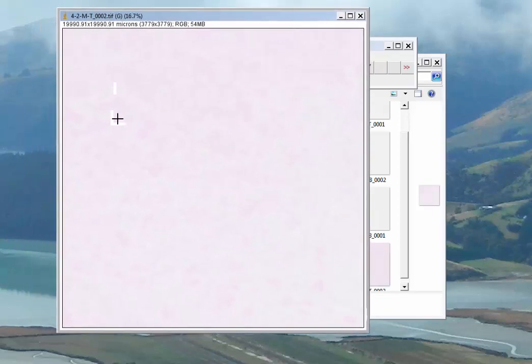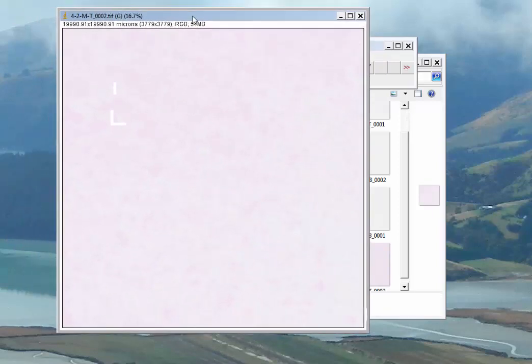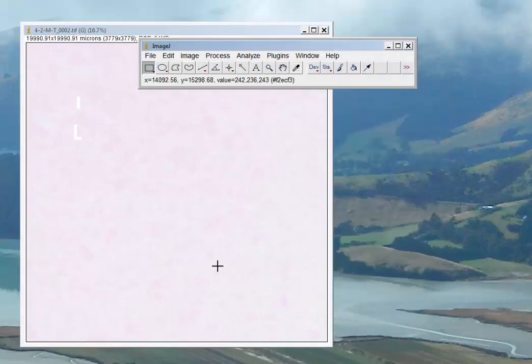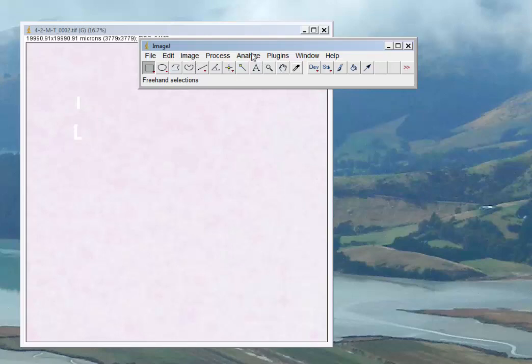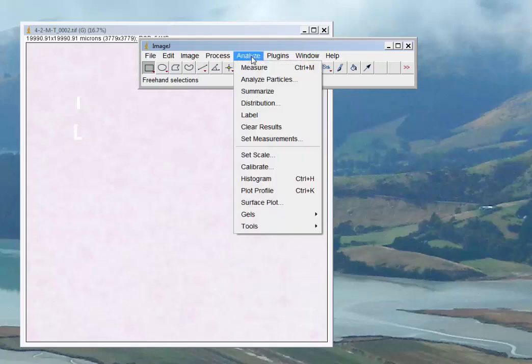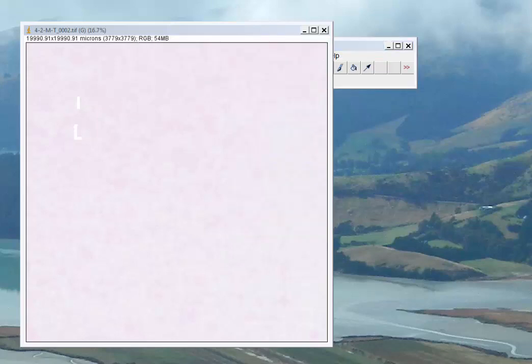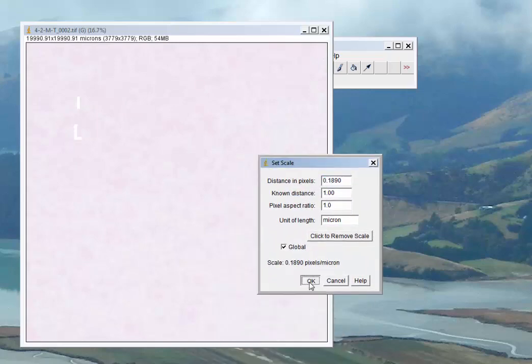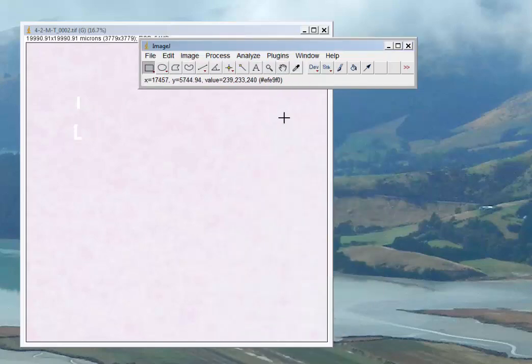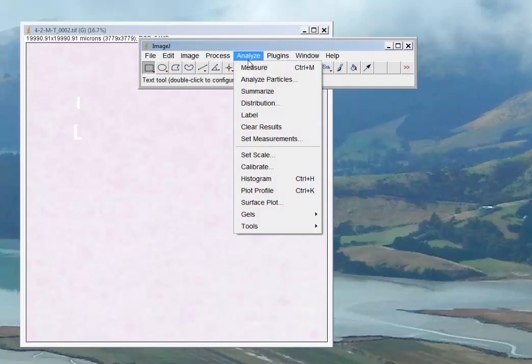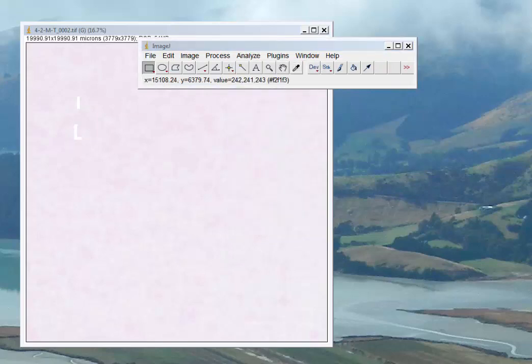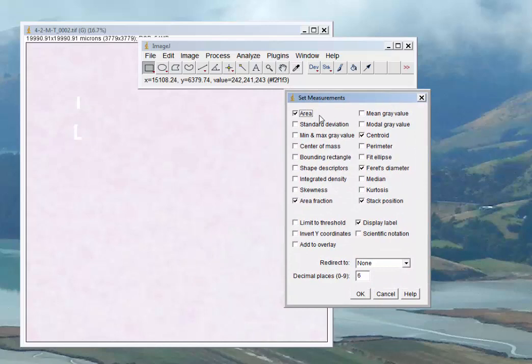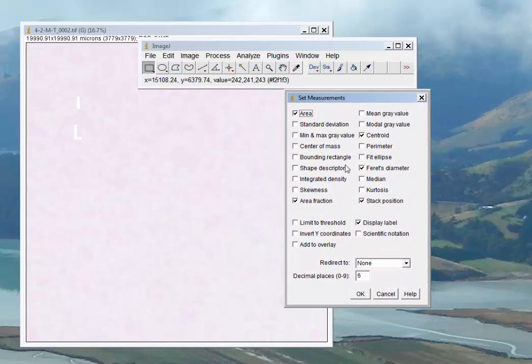There's a lot of color on here and we want a good bit of color. At this point, for good diligence, we'll go back and make sure that our scale is good. We'll check our set measurements, make sure they're still the same: area, percent area, and some other diameters and things that you might want to measure.